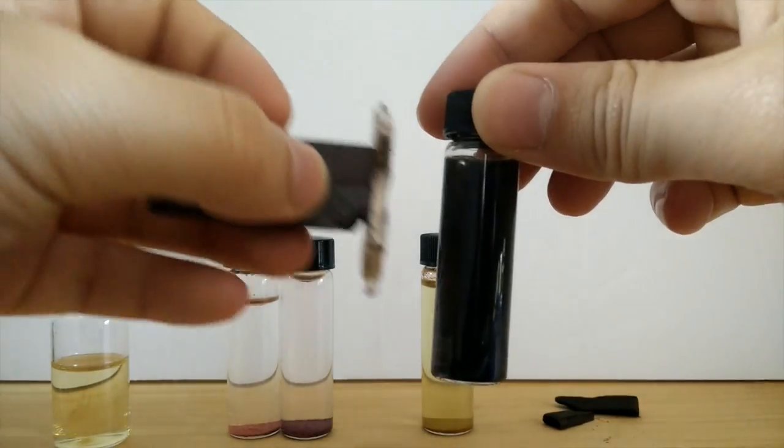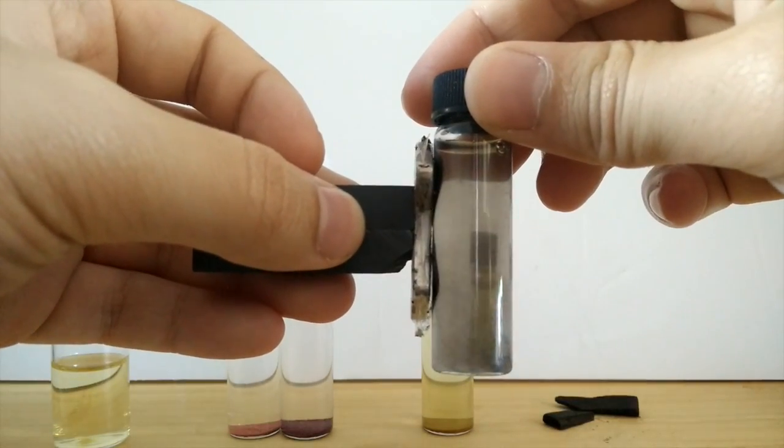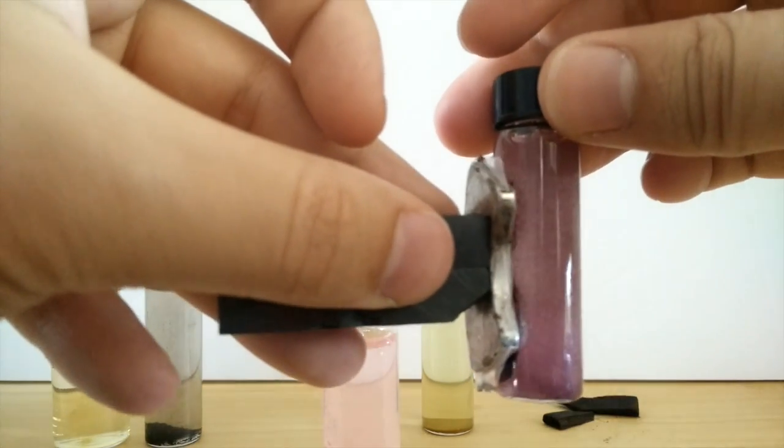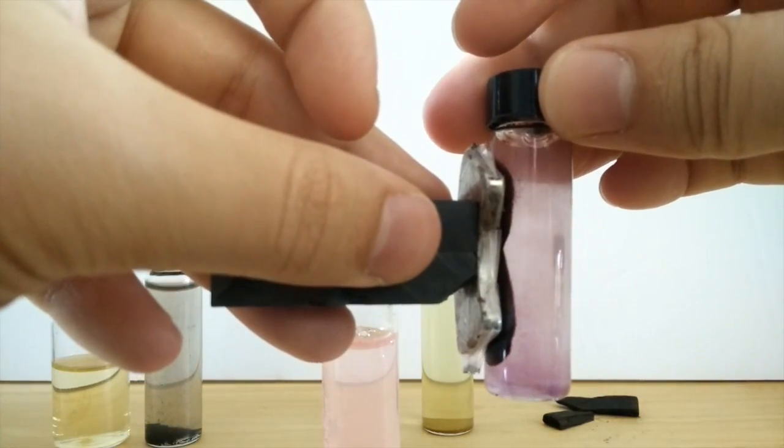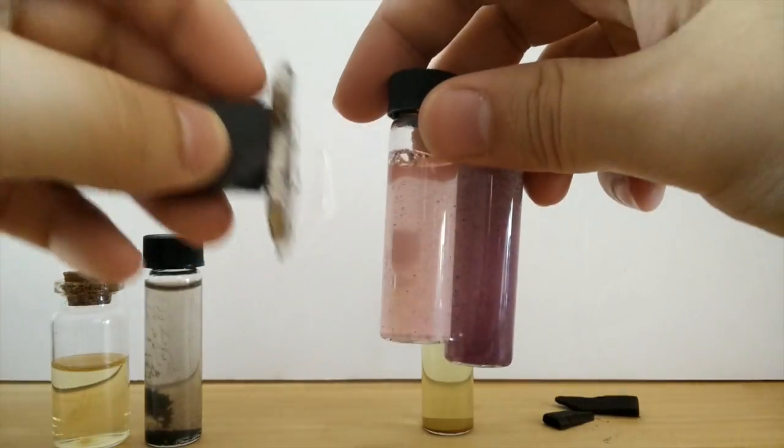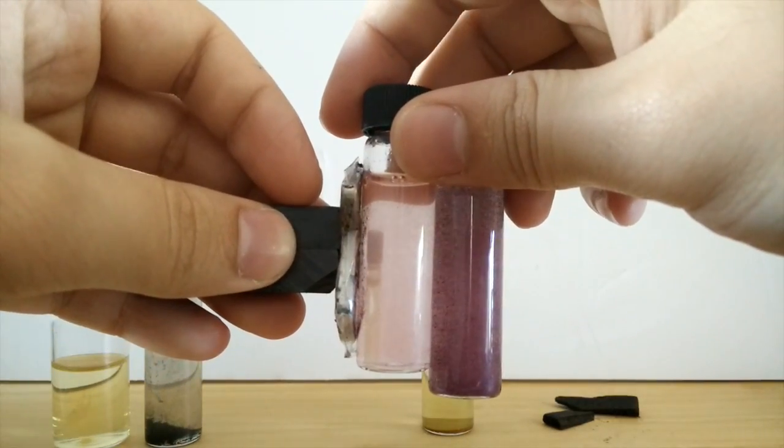In future videos I'll be showing how to use these and other paramagnetic materials to make all kinds of interesting nanoparticles. Specifically I'll be showing how to take the regular dark nanoparticles and coat them in a fluorescent dye so you get colorful magnetic glowing nanoparticles. In this case I have orange and purple.